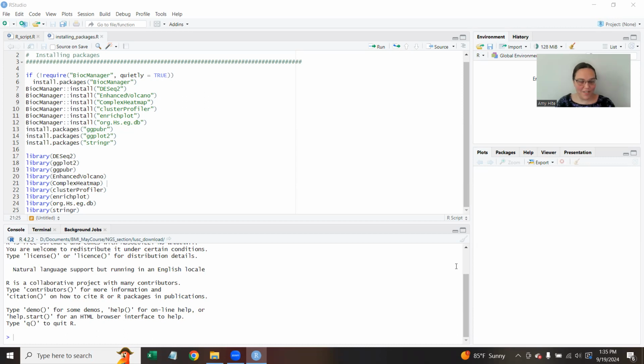Okay, hello, and welcome to the script part of this week's module. We're going to talk about doing differential expression in practice.